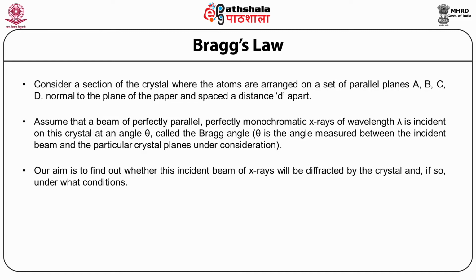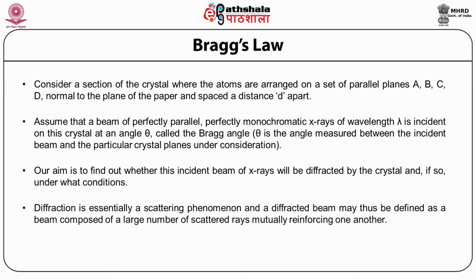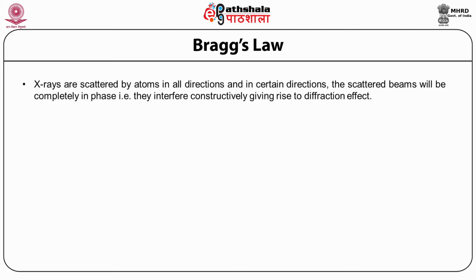Our aim is to find out whether this incident beam of X-rays will be diffracted by the crystal, and if so, under what conditions. Diffraction is essentially a scattering phenomenon, and a diffracted beam may thus be defined as a beam composed of a large number of scattered rays mutually reinforcing one another. X-rays are scattered by atoms in all directions, and in certain directions the scattered beams will be completely in phase, that is, they interfere constructively, giving rise to a diffraction effect.